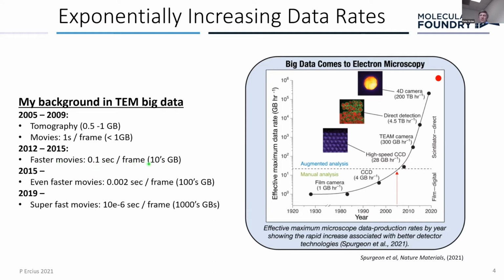And so we were getting tens of gigabytes of data sets. And we were walking around our facility with hard drives and plugging them into different computers and moving them around. We got a little bit smarter. We started to move things with 10 gigabit, getting better infrastructure, getting a NAS, things like that.